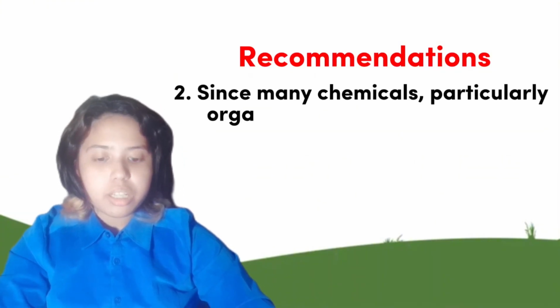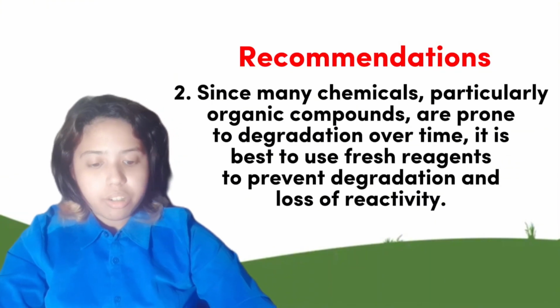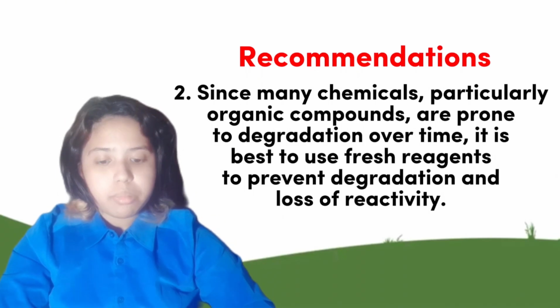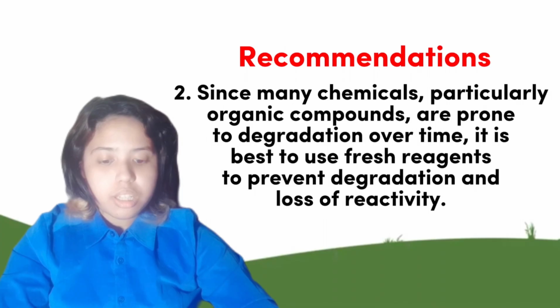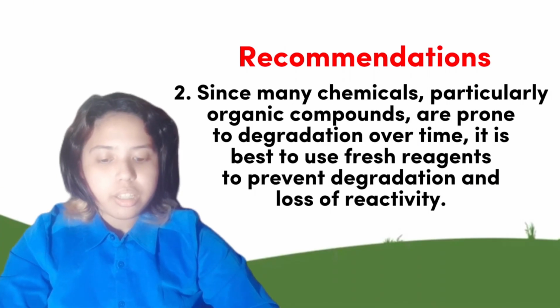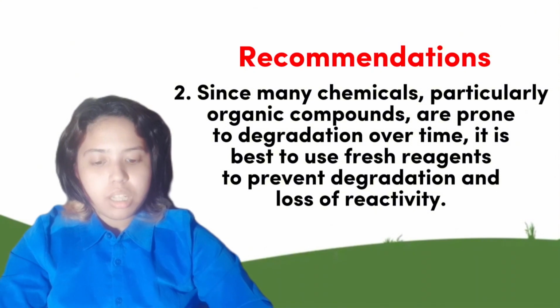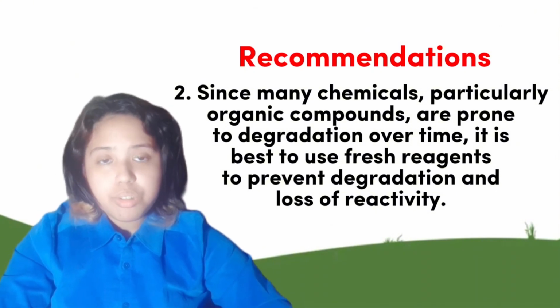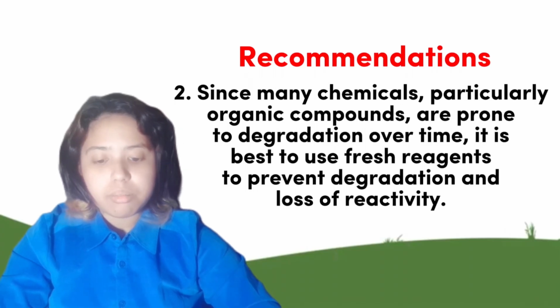Since many chemicals, particularly organic compounds, are prone to degradation over time, it is best to use fresh reagents to prevent degradation and loss of reactivity. This may result from processes like photodegradation, hydrolysis, or oxidation.